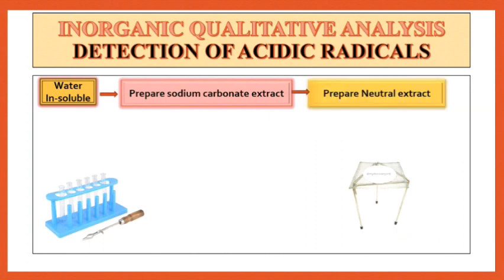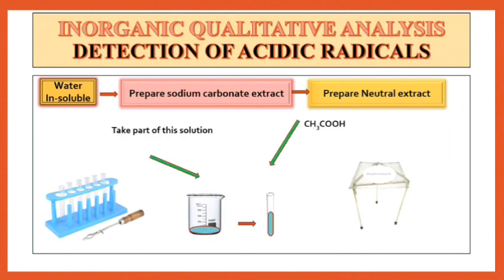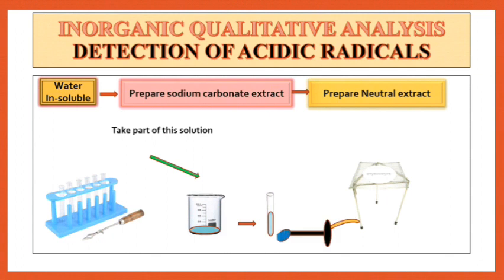Next step is the preparation of neutral extract. To prepare neutral extract, take a small portion of this sodium carbonate extract and to that add CH3COOH drop wise till it becomes acidic. Then boil it well. Now this is our neutral extract solution. We have to use sodium carbonate extract, neutral extract, or water solution for the detection of acidic radicals.